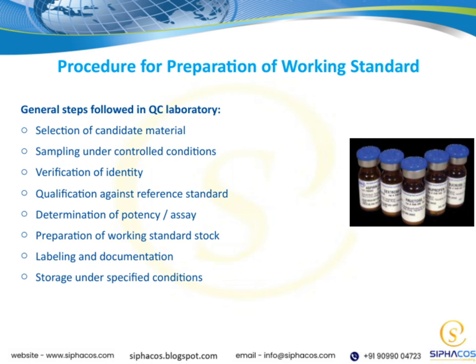After sampling, we verify the identity of the material. We need to confirm that what we have is indeed what we think it is, using appropriate analytical techniques. This step helps us avoid any mix-ups that could compromise the entire process.